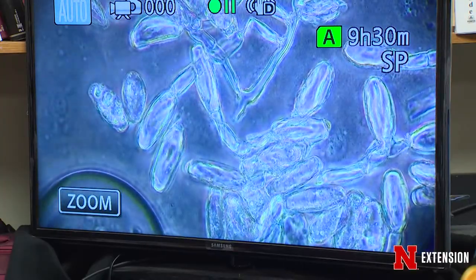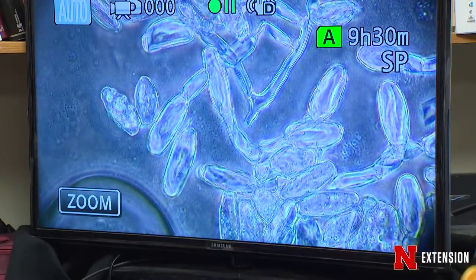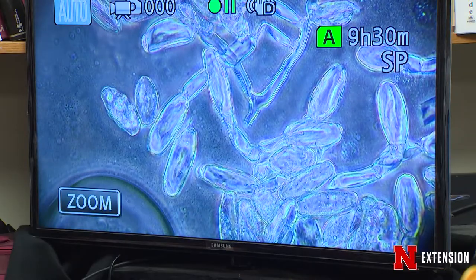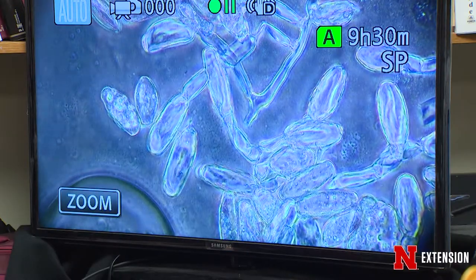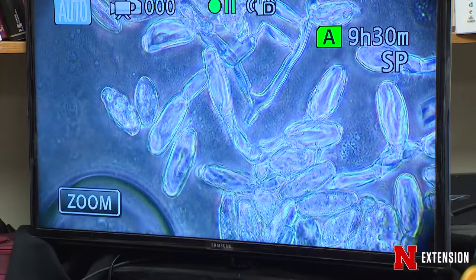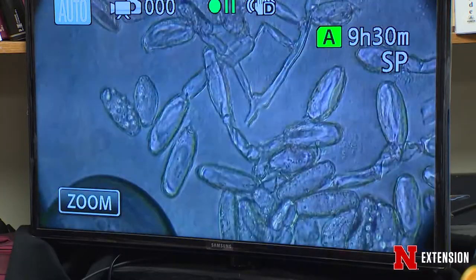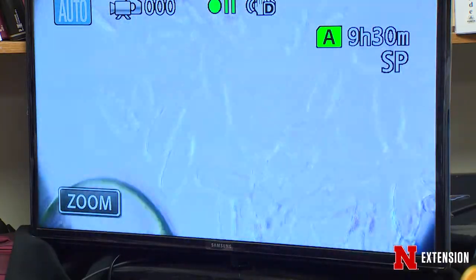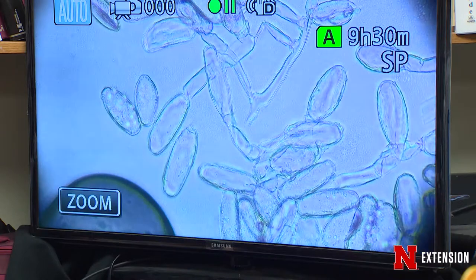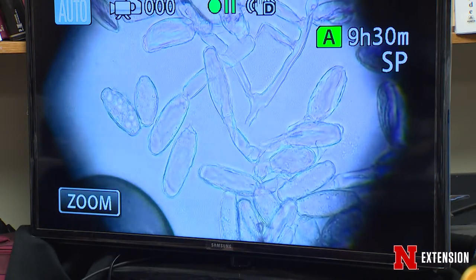In this case, we're looking at powdery mildew on these succulents here. And as you can see behind me, we have plenty of spores that have been picked up through the scotch tape and are readily identifiable on the microscope.